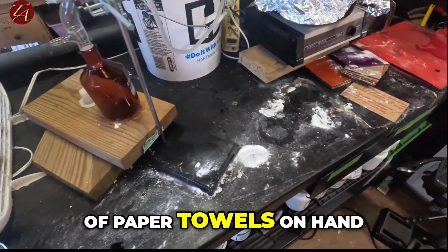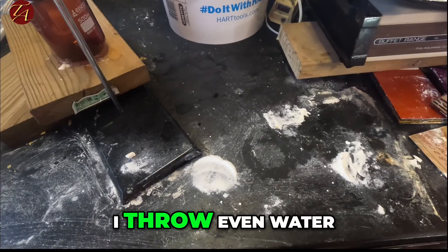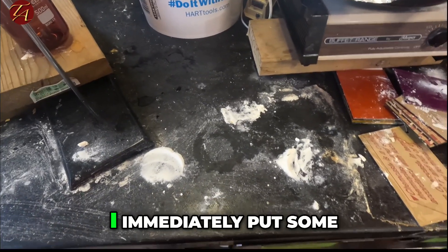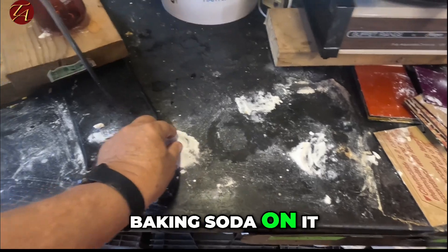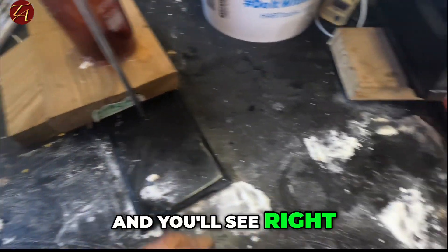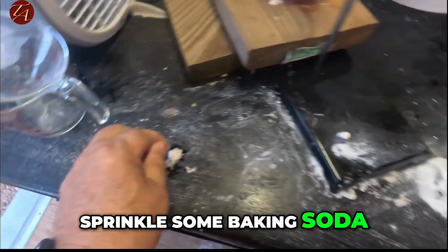I just keep a lot of paper towels on hand. If we drip anything — even water — I immediately put some baking soda on it. You'll notice right here we spilled a little sulfuric acid, so we sprinkle some baking soda on it over here.